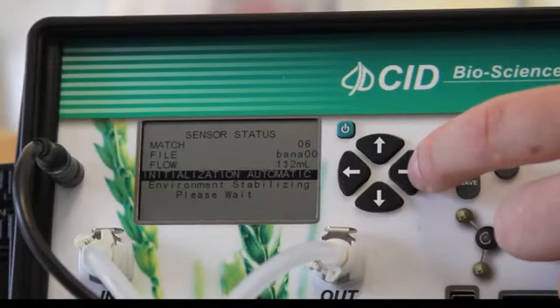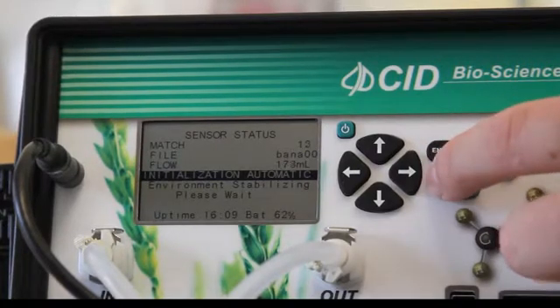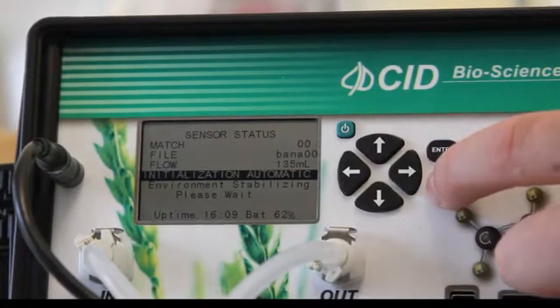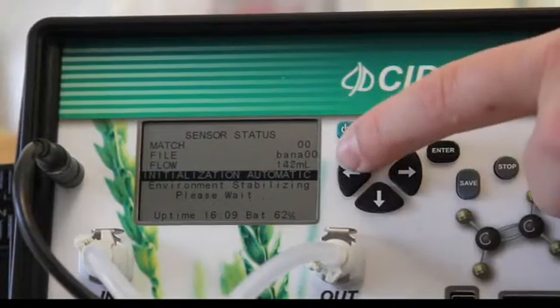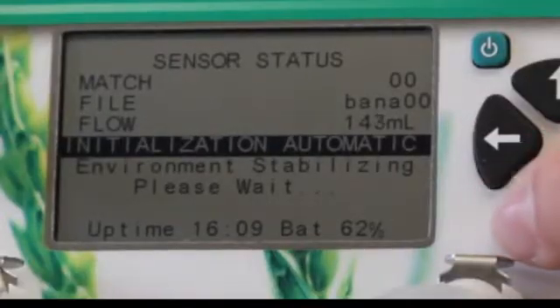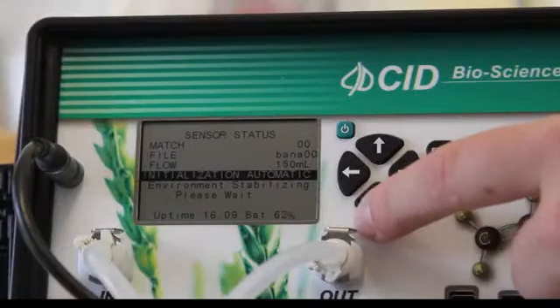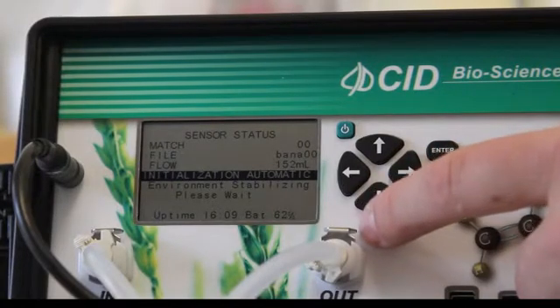This brings us to the sensor status screen. This displays the file name and the flow rate, and as you can see here it is initializing the automatic loop. What this is doing is waiting for the sensor inside the CI900 to stabilize.